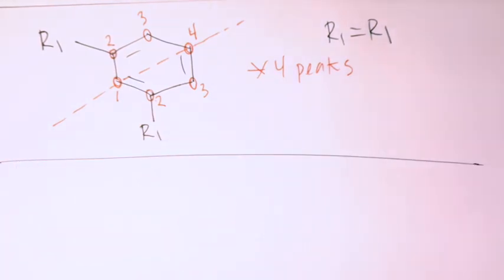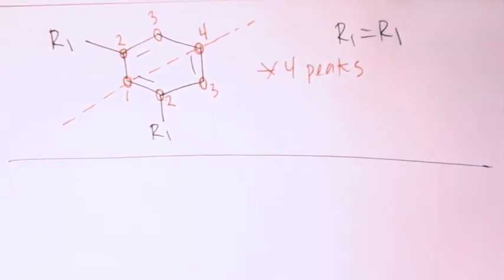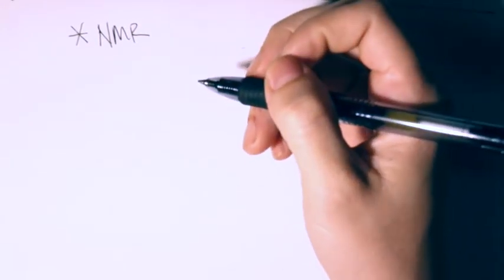Okay, so before we go on to HNMR, I did want to cover just a couple things to cover stuff that you might see in some of your NMR problems. And these things are going to apply to both carbon and HNMR. And so in your lab that you're going to be doing this week, you'll be running your NMR neat, which means it's not dissolved in anything, it's just plain substance.